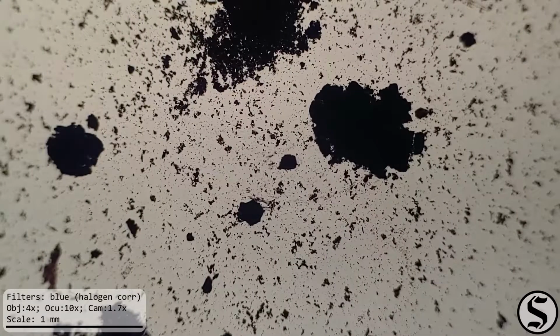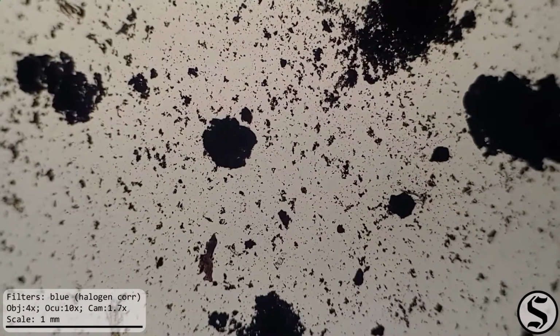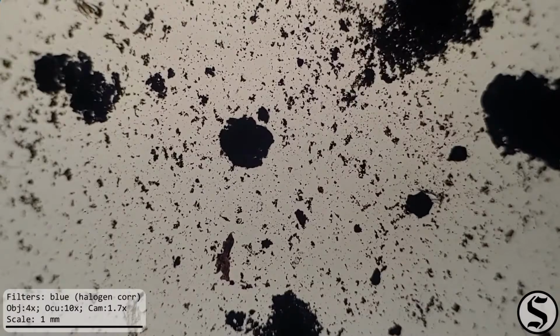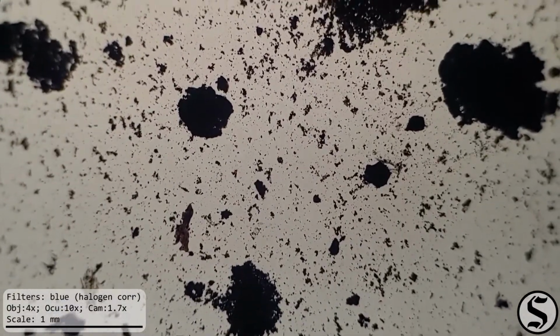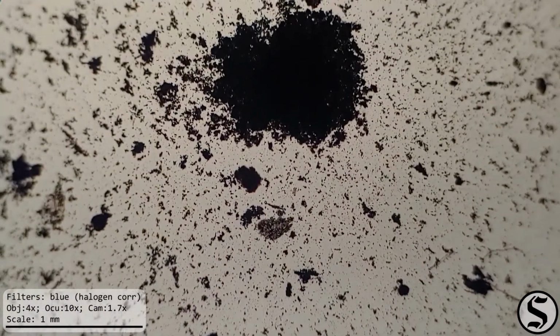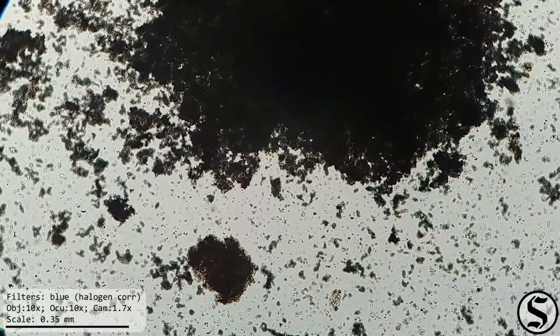Now, looking here at the sample of the darker ash, ash being another word of Germanic origin that means what you think it means, we can see some dark, sort of blob-like structures. Ash is what's left behind after combustion, and given the temperatures that a fireplace operates at, the combustion is not complete, and so there's going to be leftover carbon.